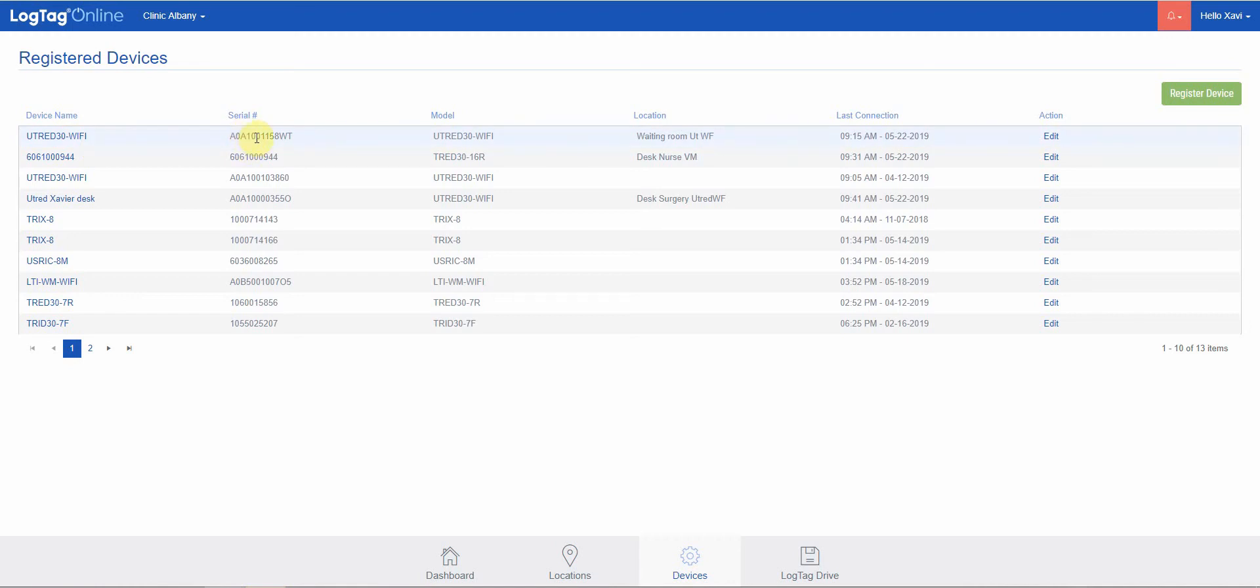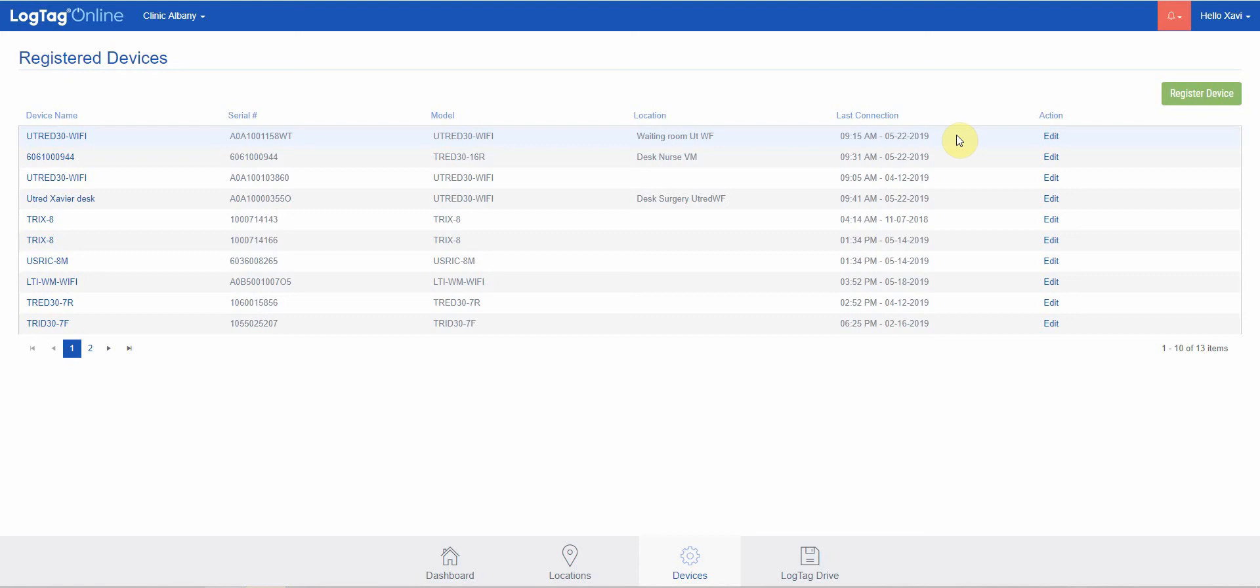You'll see the serial number of that device, the model number, if it's been attached to any location—so if that device is used to monitor a specific location from the dashboard—and the last time we had a connection event or received information from that device.